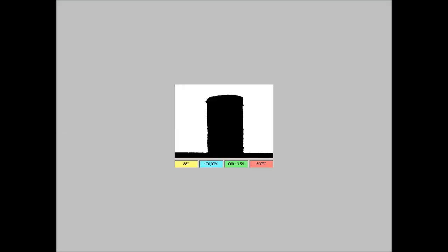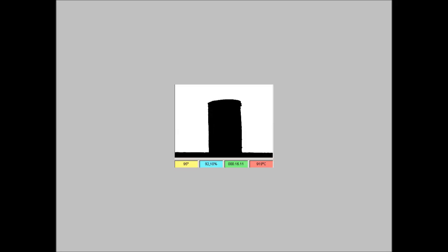The images taken during the test can be seen as a movie and exported in AVI format. Looking at the movie at higher speed we can enhance the transformation of the sample.